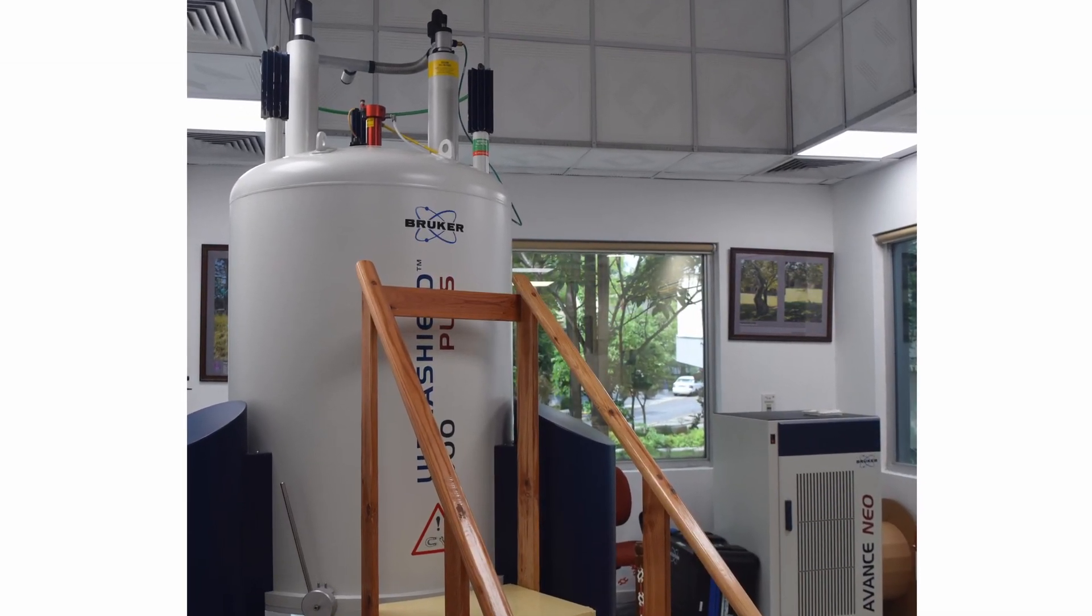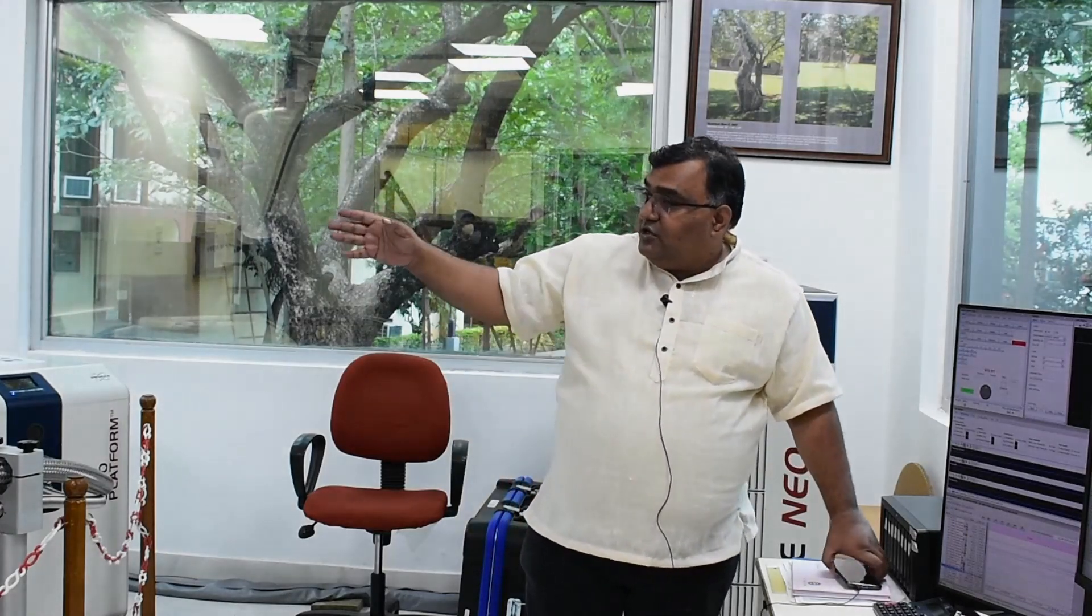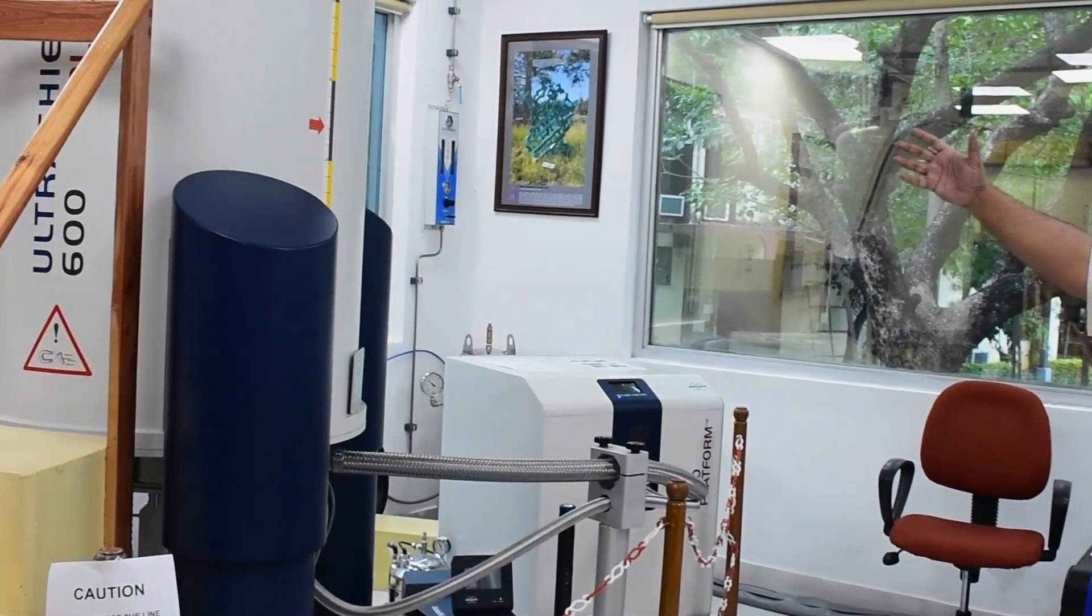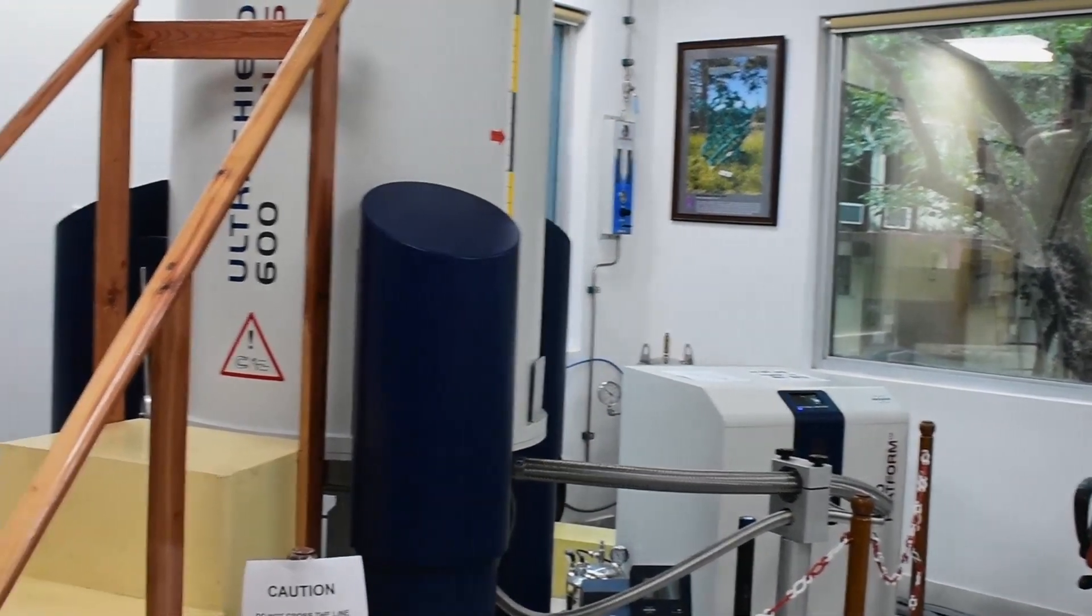Let us understand what an NMR spectrometer consists of. Hi, this is Dr. Mandar Deshmukh. I am a scientist at CCMB and I use NMR spectroscopy. Here you can see there are three components of NMR spectroscopy. One is this magnet, and if you see this is a big barrel-like structure in grey color, resting on three legs.